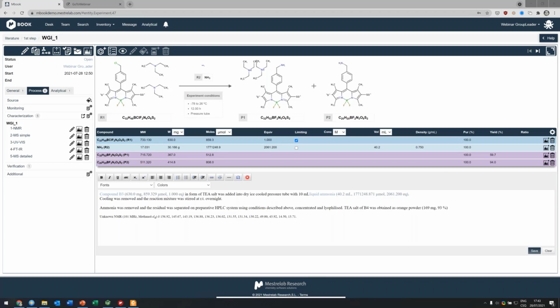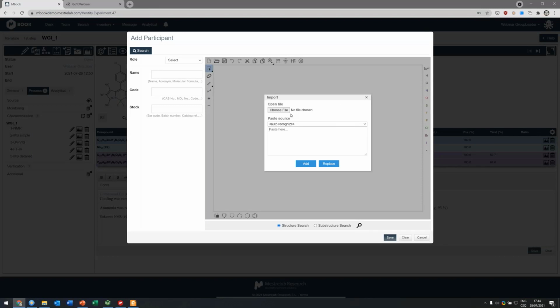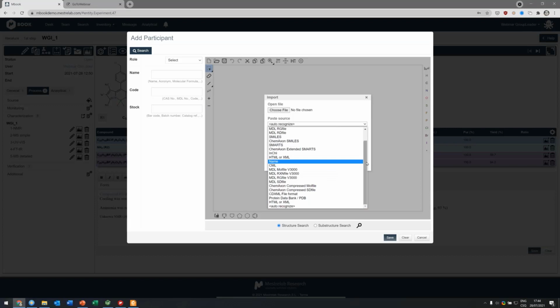Another question: the reaction output with the extension, is it executable in this software? I'm not really sure what it means. We don't have Reaxys itself connected, like ChemDraw does, but maybe the best answer is that you can choose the file and the source format, which fully supports the Reaxys standard and ChemAxon, because actually the molecule editor is derived from ChemAxon.